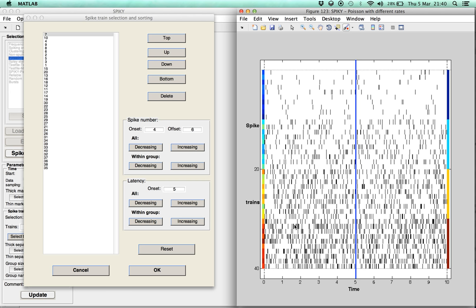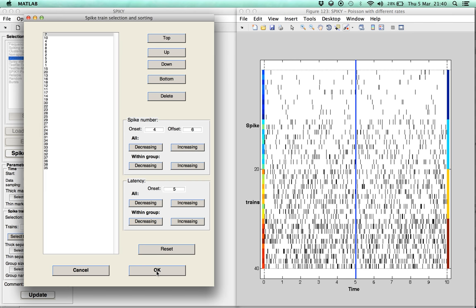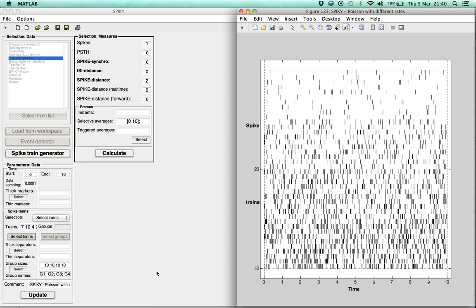Once we are satisfied with a certain spike train order, we confirm this order by pressing OK. And from then, the analysis can proceed as usual.